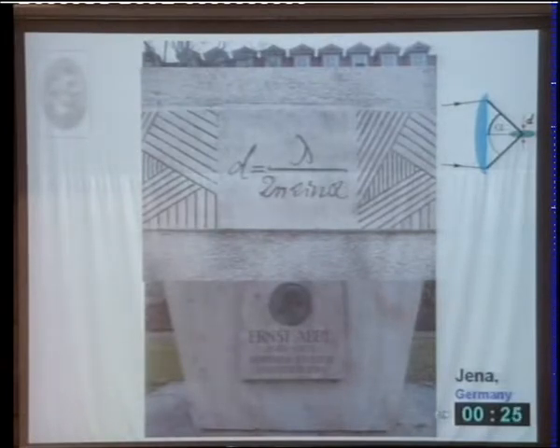Now, this has been, so to speak, the general basis of what people thought a light microscope is able to do. And, of course, many other techniques have been developed, as Sandy just mentioned, that have been very successful and very powerful, not least the electron microscope. At the end of the 20th century, the gold standard in focusing light microscopy became the confocal microscope. And the confocal microscope was very important because it provided background suppression and it allowed us to do three-dimensional imaging non-invasively, especially in living cells.